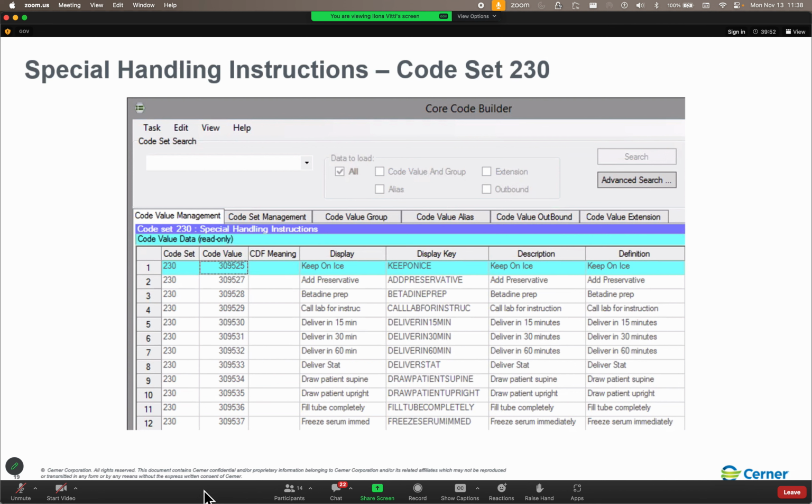But the reason why it's sporadic is that it really does depend on how the order is placed. Are we submitting 5 orders at one time, or are we submitting 50 orders at one time? So if it came in with a whole bunch of other orders, then yeah, you're probably going to run into those orders being sent in different data packets from the order write synchronous server or order write synchronous for FSI to the lab share, and from the lab share to the netting server.